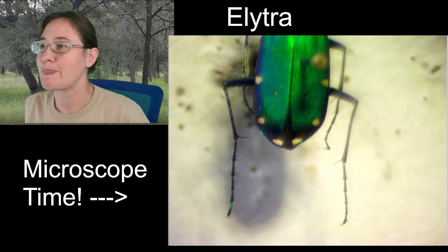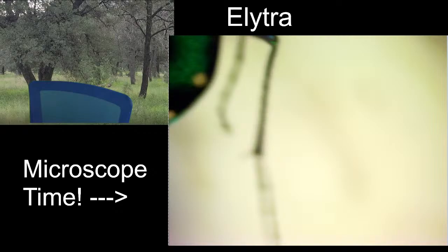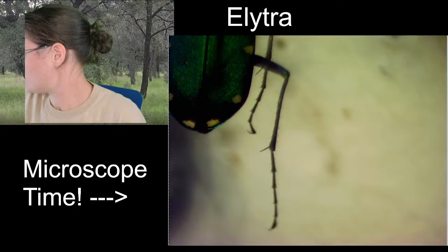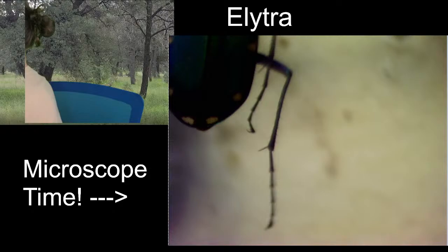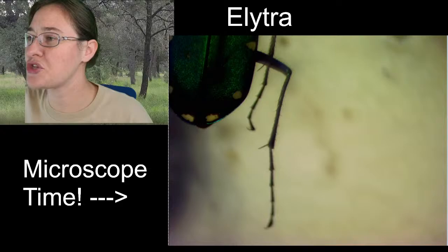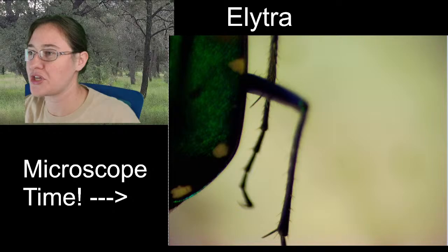Let's go ahead and look at the leg on the right. More light. Give me more light. They say, no! This is fine. We'll probably zoom in on the tarsal segments. So instead of trying to get the whole leg in focus, we're going to zoom in right here on the femur and the tibia, and then we will focus it back down when we're looking at the tarsal segments. That's what we'll do.